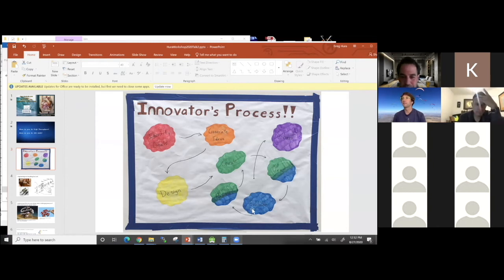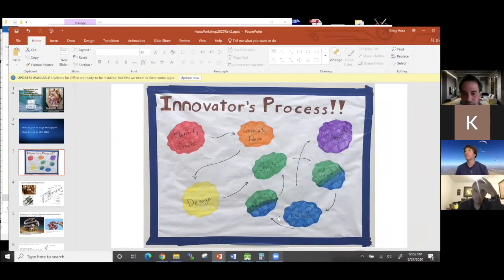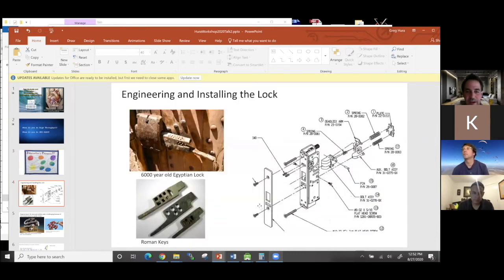In structural biology, there's very few techniques where you can do this redesign cycle, where you can test multiple things over and over again and just try to figure out what's going on. And SAXS, high throughput SAXS, is one of those things. So the example I give is the lock.